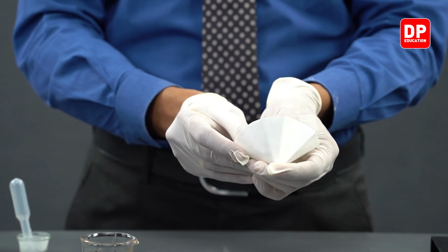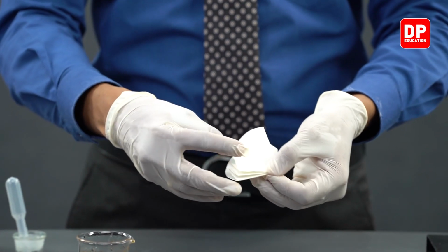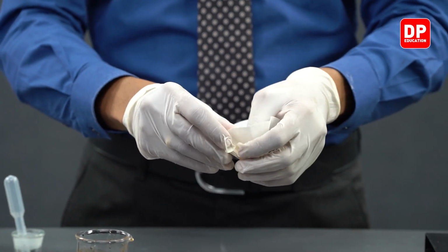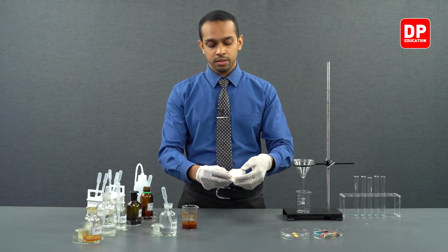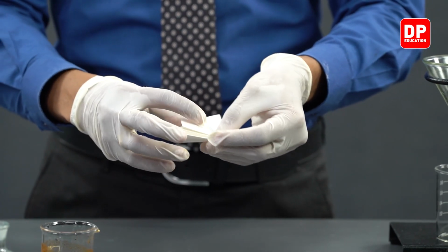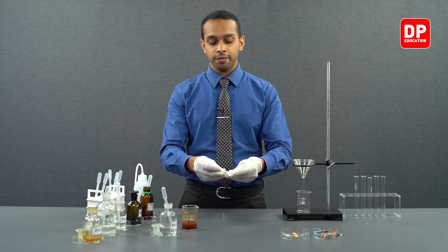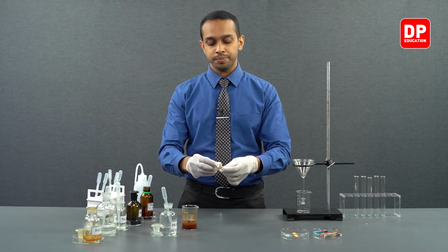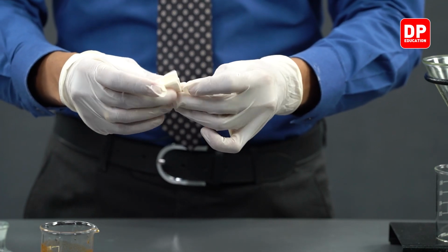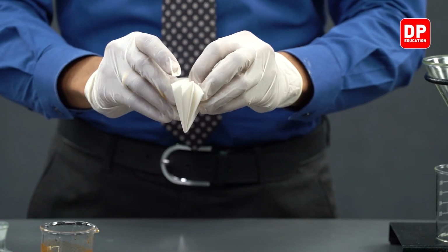You have to make sure that you keep folding it in the right manner, like you see over here, so that you can create an open structure that will allow the suspension to be filtered properly. So, once you have done that, you can open it up like this.